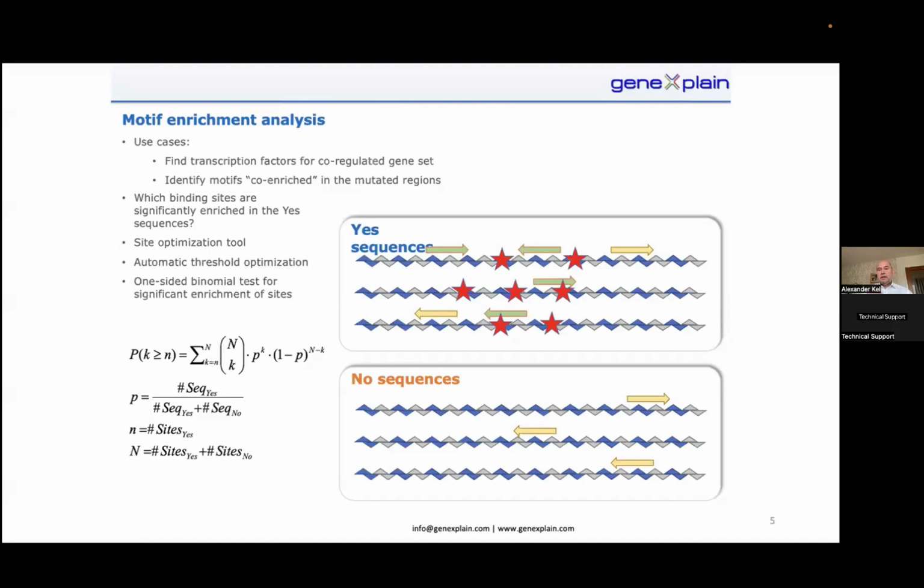So okay, that's a little bit of theory which we are using here to analyze mutations of cancer. And if you have questions to that, don't hesitate, just drop them in Q&A. Maybe it's just a small question I can quickly answer. Or just think about your questions and put them in Q&A.